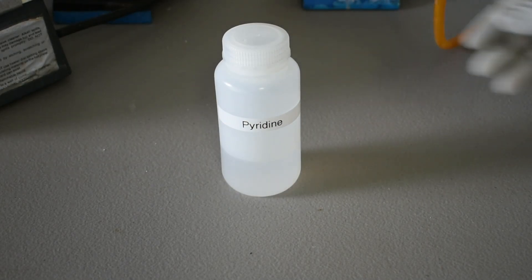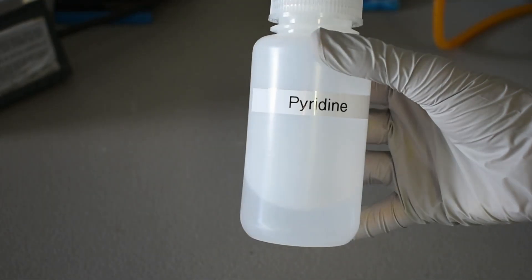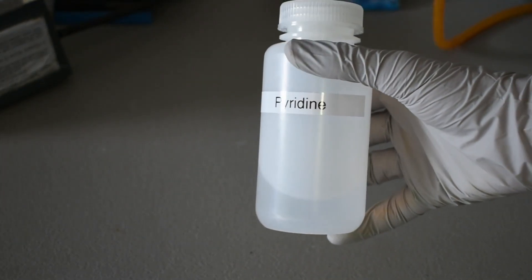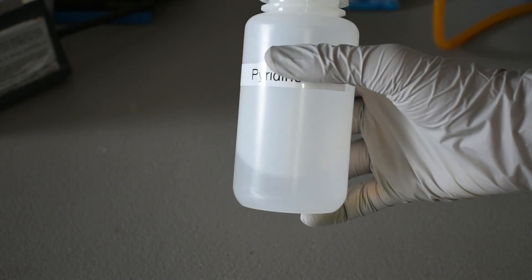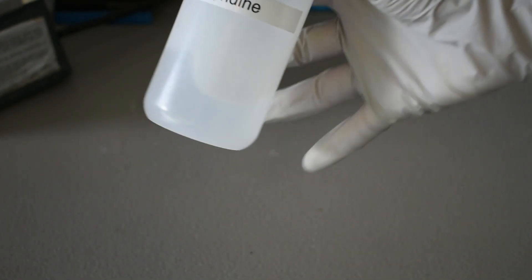Here's our final product. A total of 88.6 grams of pyridine, which corresponds to a percent yield of 55%. Now that's not the best yield, but I don't need very much pyridine. I'm not too worried about it.